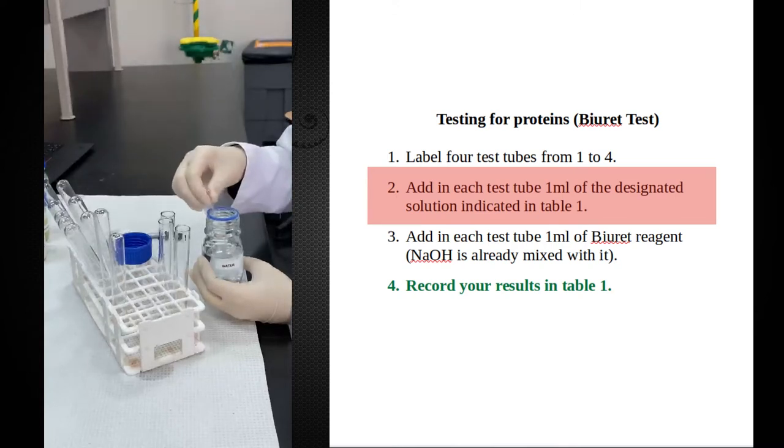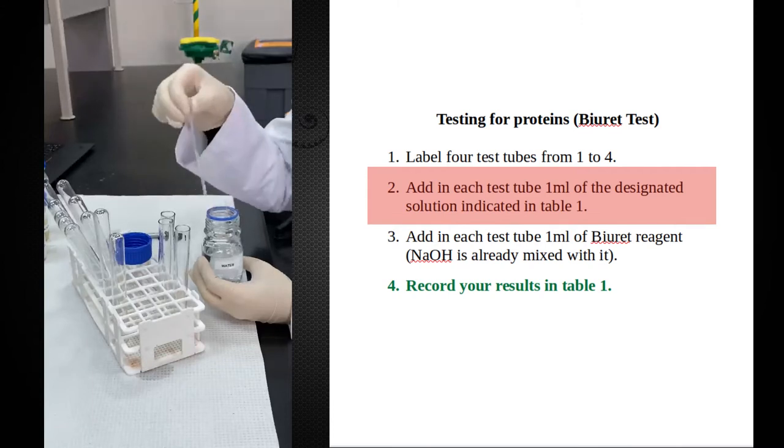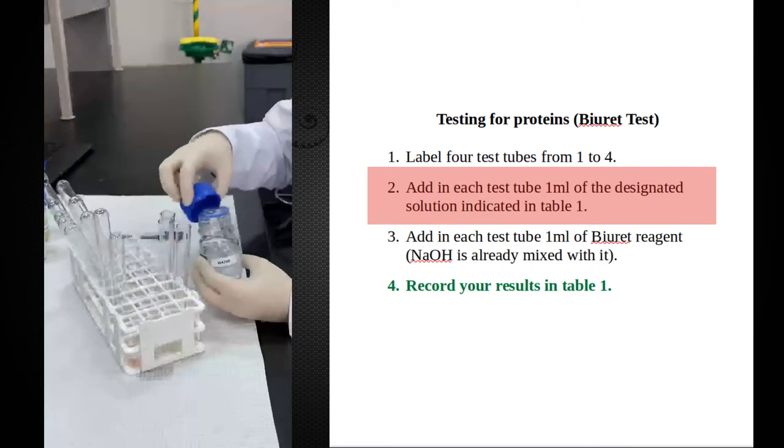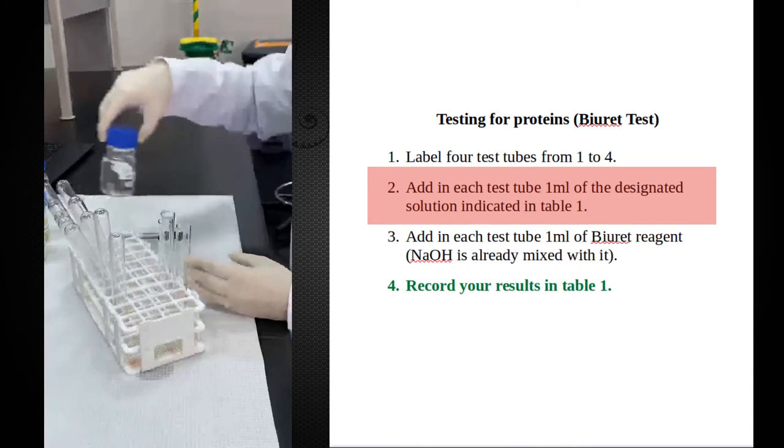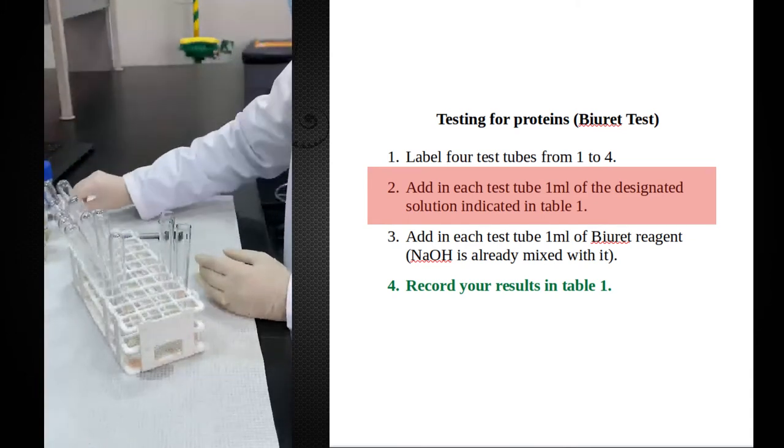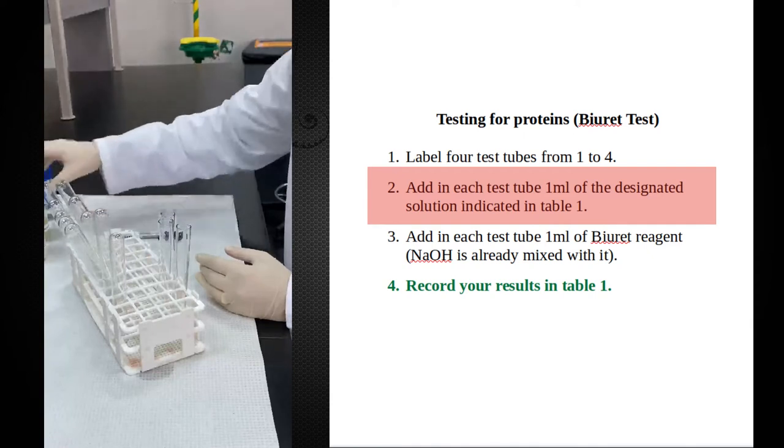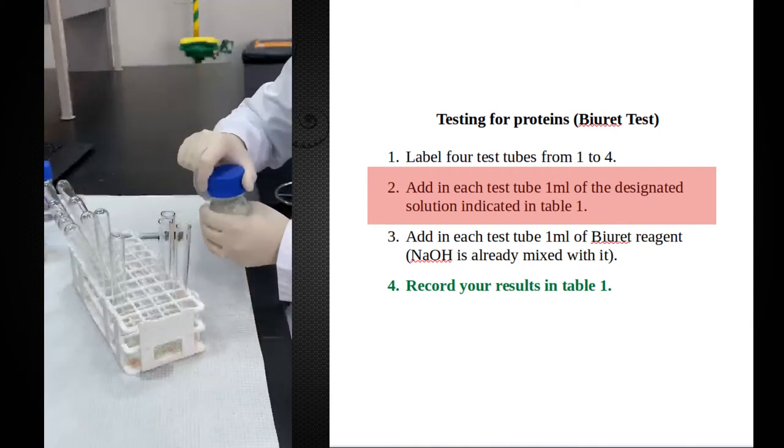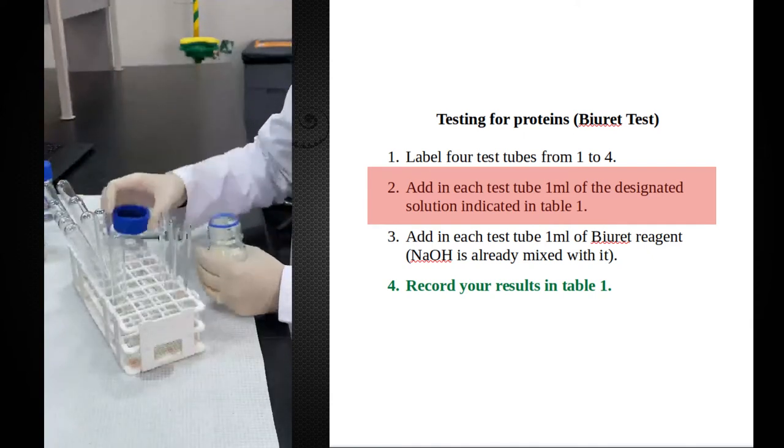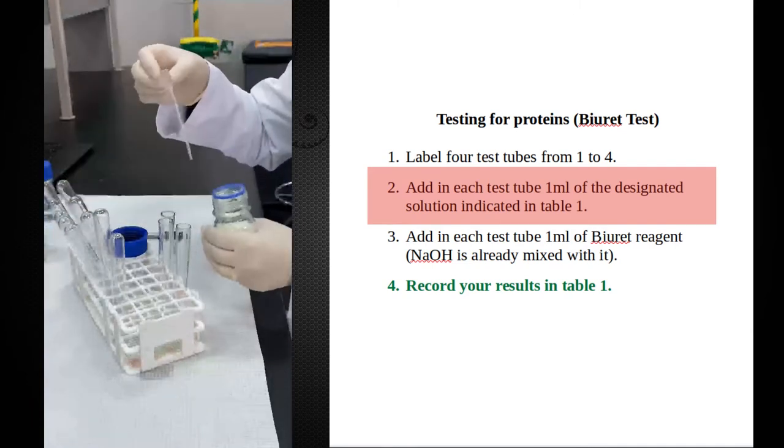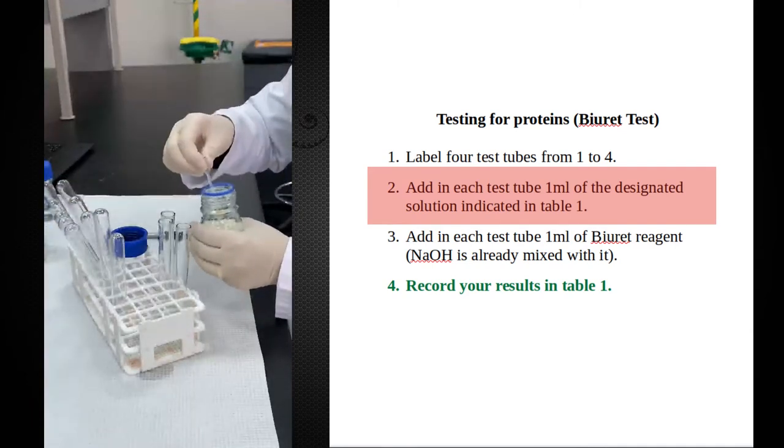My second test tube has to be a positive control, something that I know contains a protein. For this purpose, I am using egg albumin. So with another dropper, 1 ml of egg albumin.